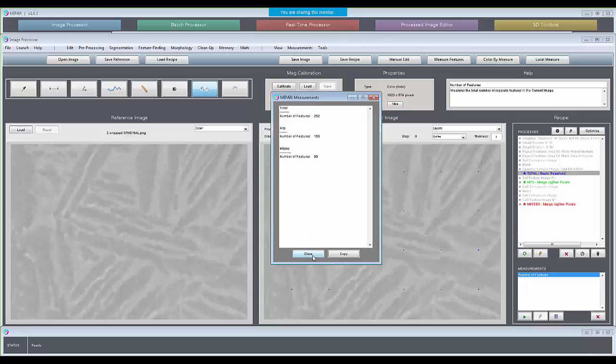You also asked about Z dimensions, Maria, so that's probably going to take us into 3D analysis. In principle, if you take a polished sample and you've cross-sectioned through a random microstructure, then you've observed a nearly infinite number of cross-sections through a 3D microstructure, so there is some Z-dimension contribution inherently in any 2D cross-section through a 3D microstructure.